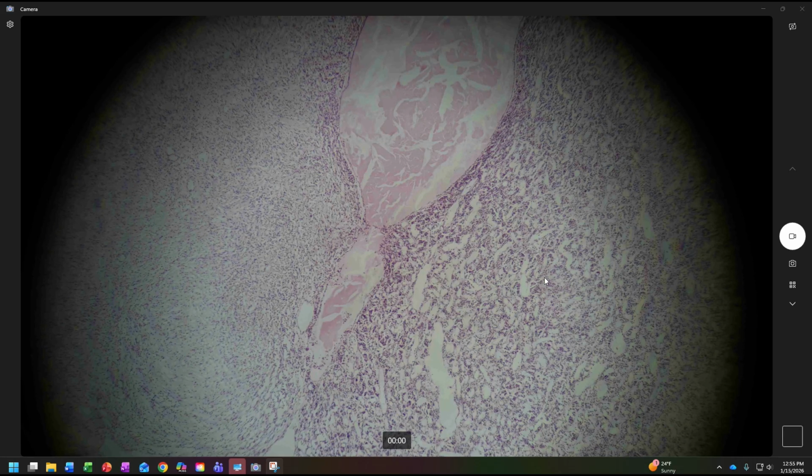And I want you to pause and try to guess, not guess, but use the things that we've learned in this video so far and figure out which one's the anterior pituitary and which one is the posterior pituitary. So take a moment if you need to, push pause, and push play when you are ready to hear my discussion. So if you press pause, fantastic. If not, if you're just going along, that's fine too.